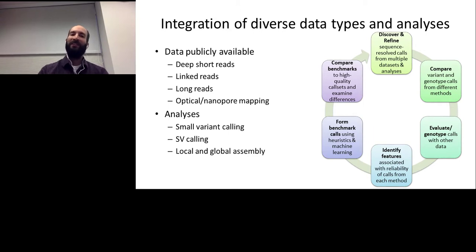And then to evaluate the benchmark calls that we get, we compare these to other high quality call sets that you might want to benchmark against, and then manually curate any differences between other call sets in our benchmark. And our goal in the end is to result in calls where if you compare to our benchmark calls, the majority of putative false positives and false negatives are actually errors in your data set rather than errors in our benchmarking call set or errors in the comparison process.